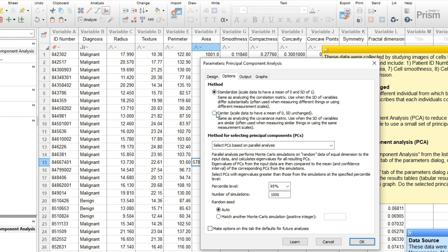In rare cases, you might want to only center your data. The most common situation for this is when each column of data was measured on the same scale, so the size of the numbers across the columns have meaning. In even more rare instances, you might not want PRISM to center or standardize your data, so we provide an unstandardized option.